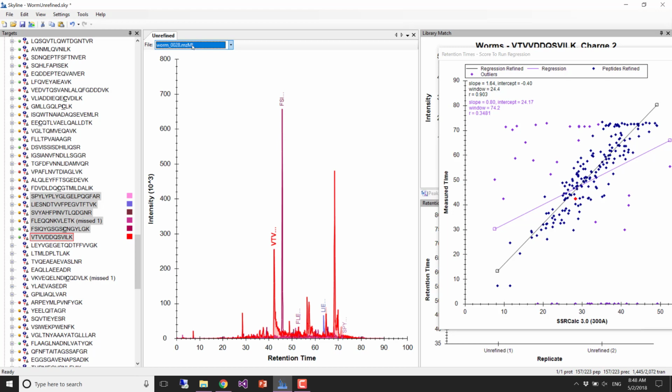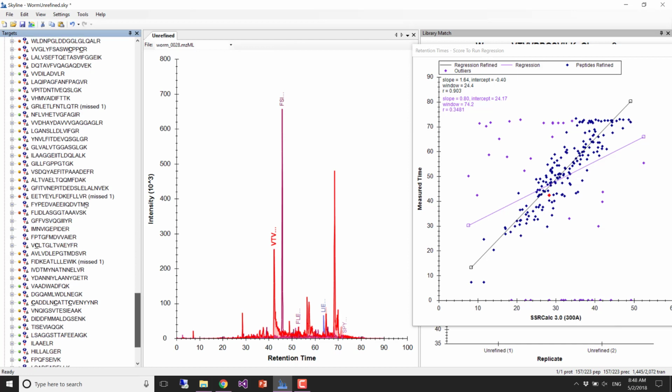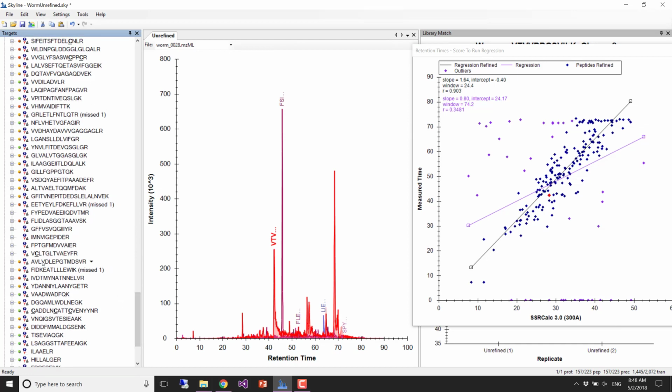So that, again, when we have a transition list, so you export a transition list, then there's a manual step to merge those transition lists into method files. And it seems like the mass spectrometrist who did this, who's actually one of the more meticulous people I know, in the process of creating 40 methods from transition lists, she mixed one up, and then actually, if you look down here, there's another one that got mixed up too.